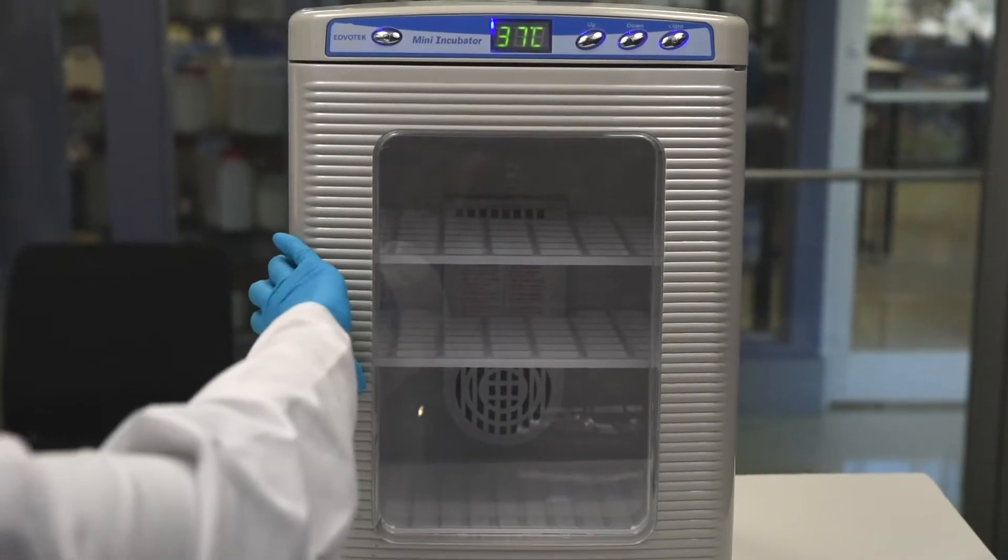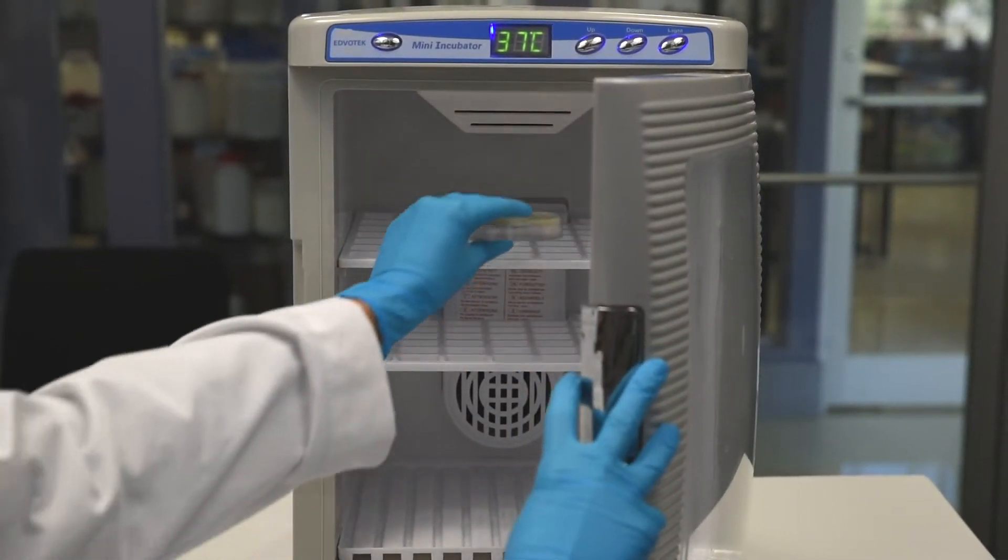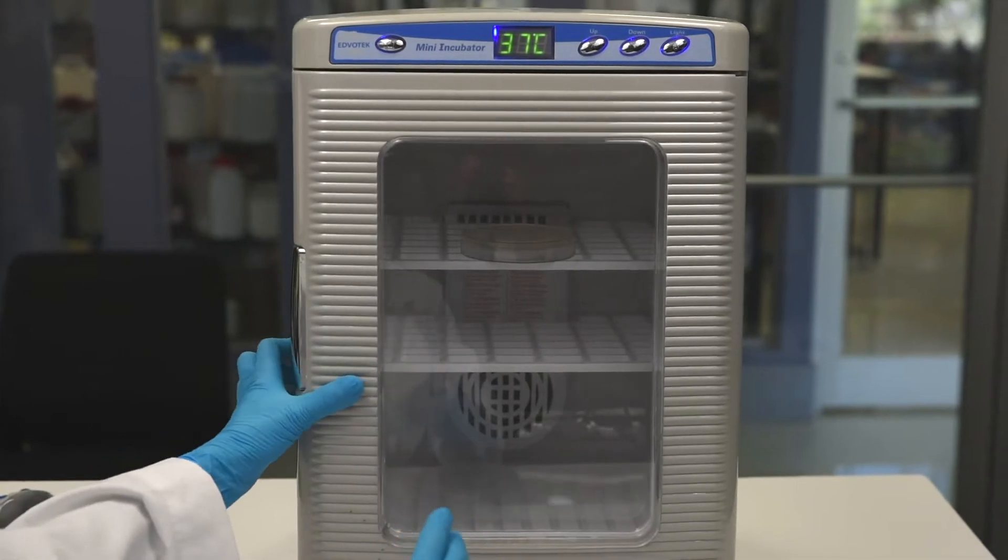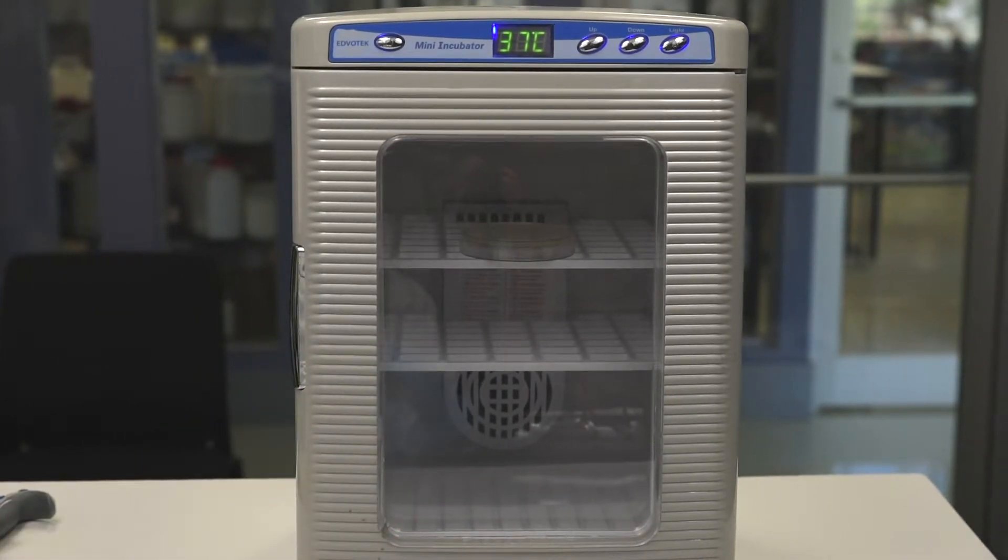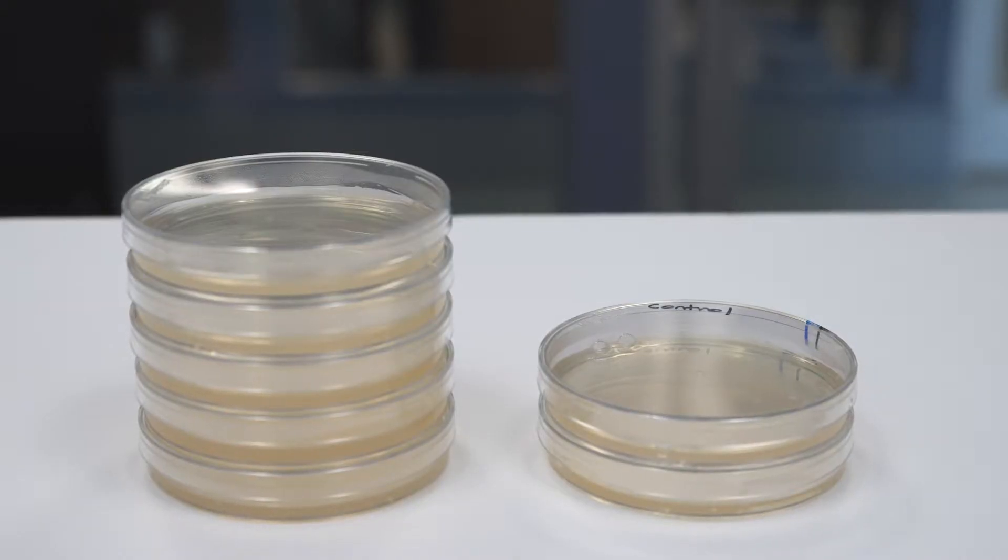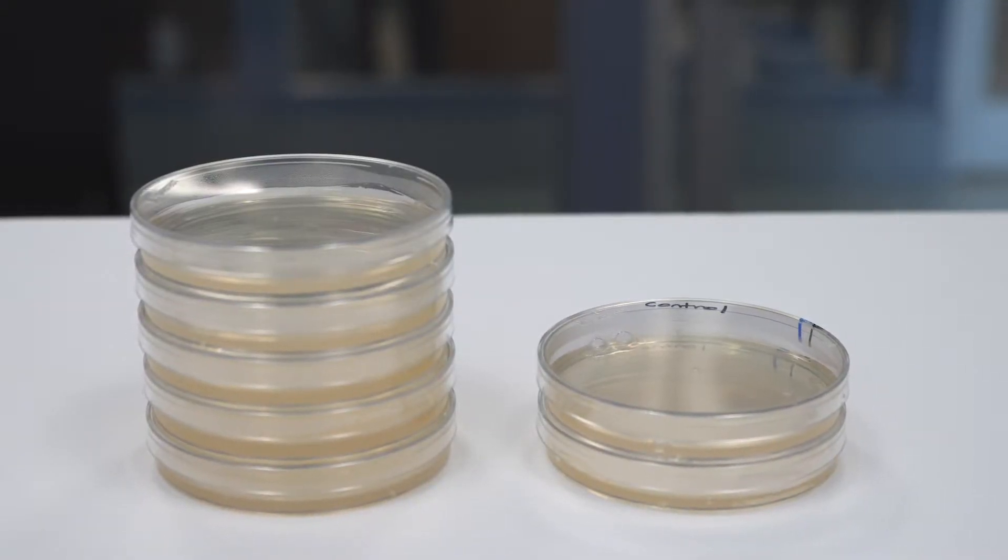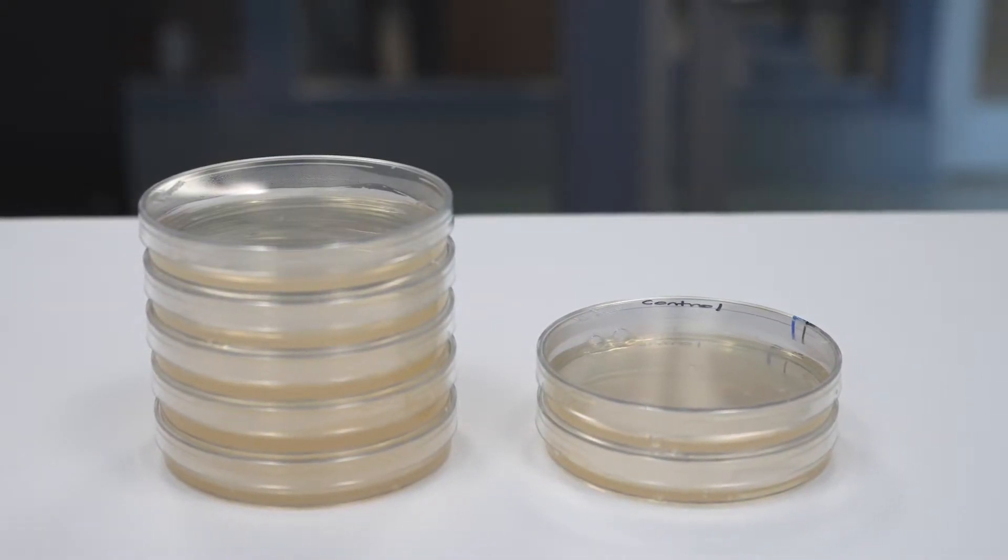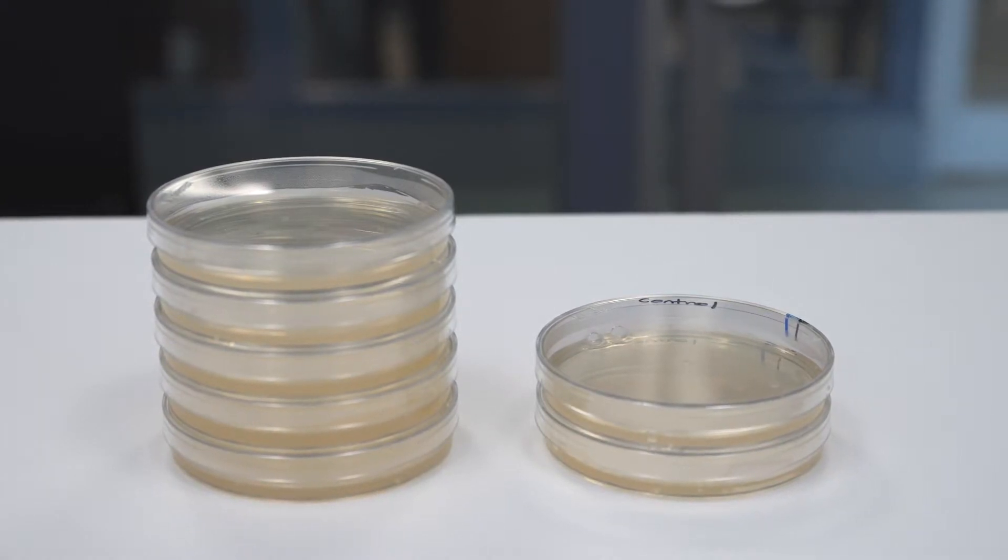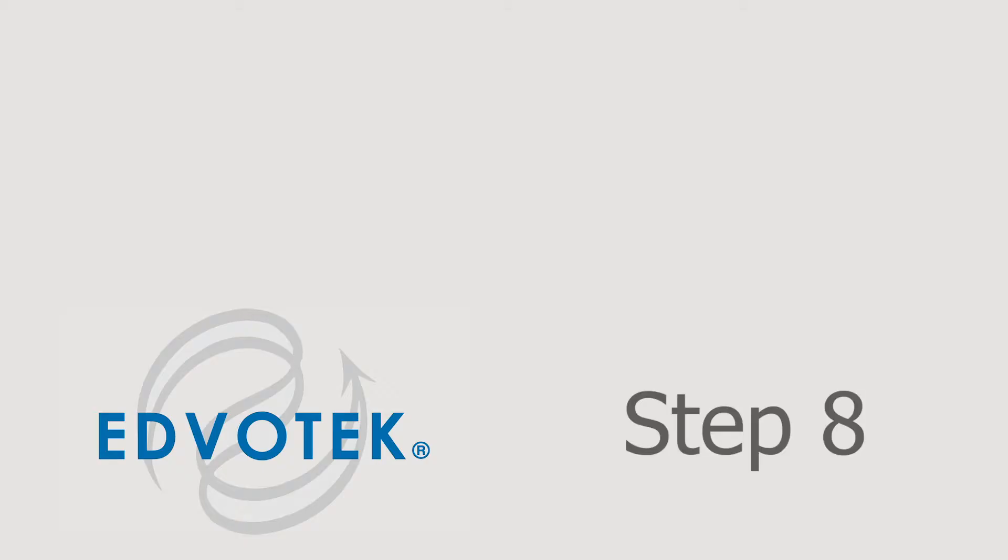If you do not have an incubator, colonies will form at room temperature in approximately 24 to 48 hours, although transformation efficiency may decrease.